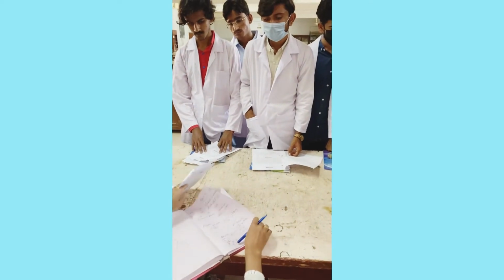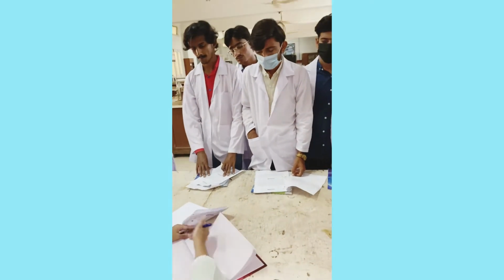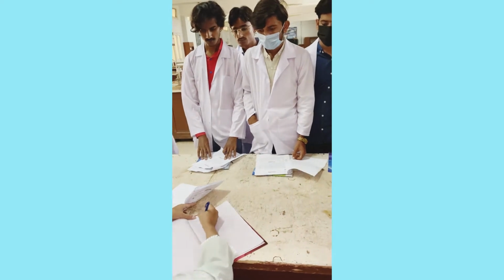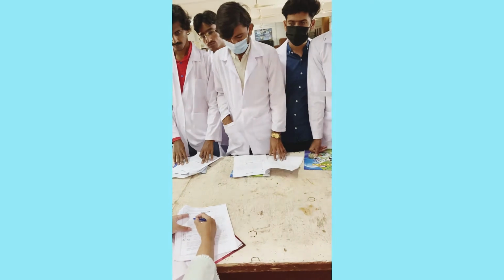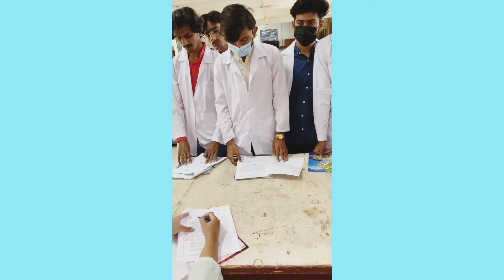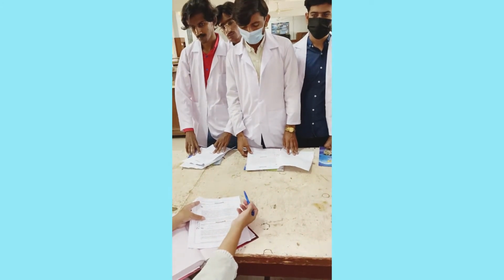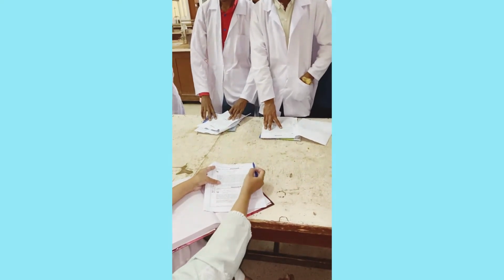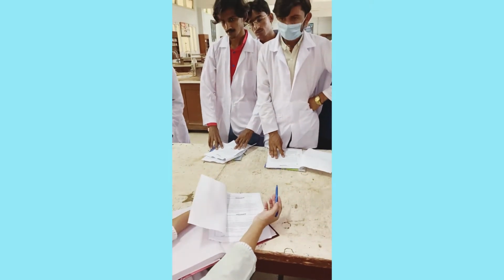Now after writing this equation, you will turn the page and you are going to write down the mechanism. This is the theoretical part of the experiment I am explaining to you. Now every reaction has a mechanism. This is a very simple equation in which a nitrating group is being used to react with this acetanilide, in which a process of nitration is going on. A nitro group attacks this position, right? And you will come up with these two products. So it's simply a one step or two step reaction.